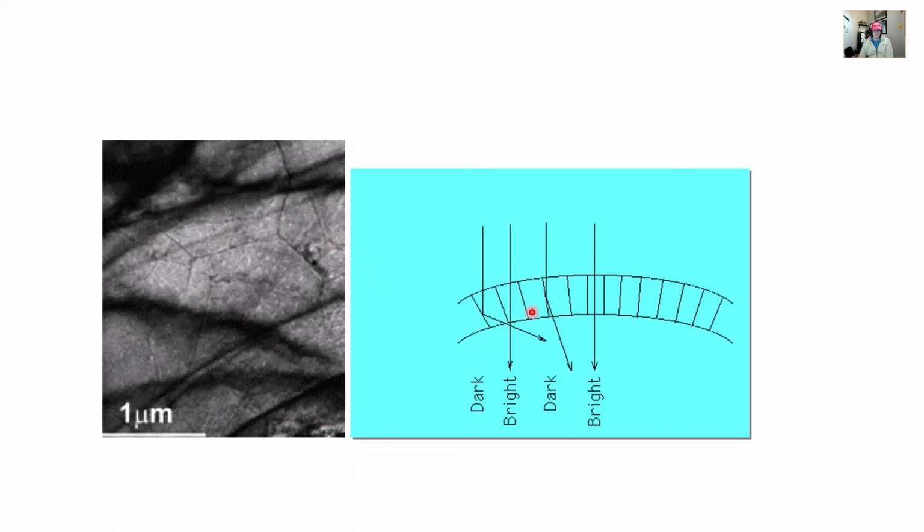And this is another kind of depiction. So you have your specimen bent, so there's lattice distortion actually because your specimen's bent, so the beam's deflecting elsewhere. The resultant image doesn't have very good definition where these contours are forming. So that's a bend contour.